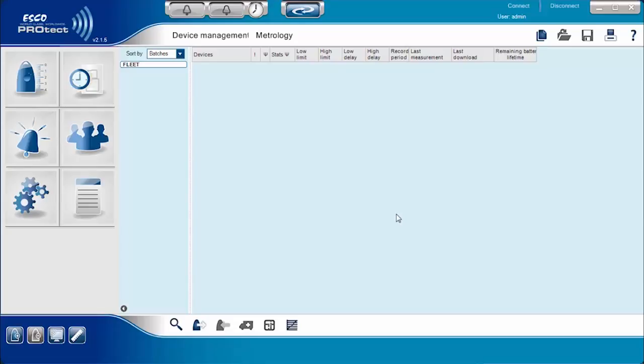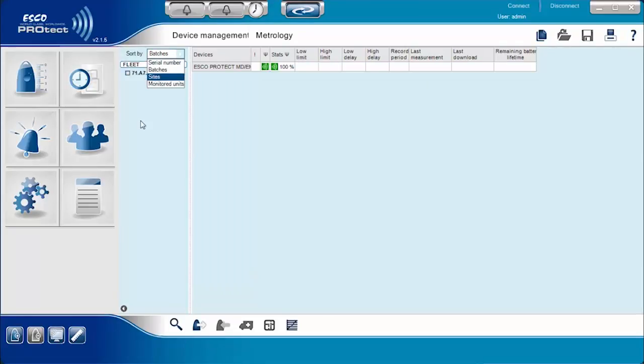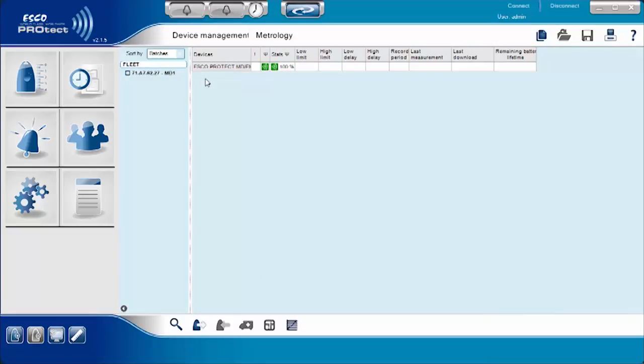Before connecting the ProTech device, the user must connect the ProTech modem first. There are two different modems on the ProTech software system. The first is the EMD-1, where users can connect a PC and a modem through a network connection using an Ethernet port. The second is the MD-1, where users can connect a modem directly to a PC via USB connection. In this particular video presentation, we are using the MD-1 modem.